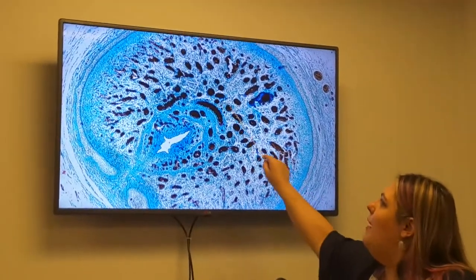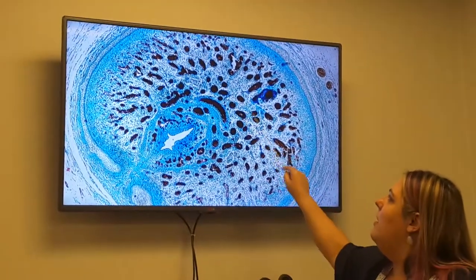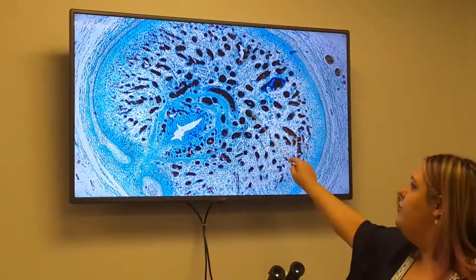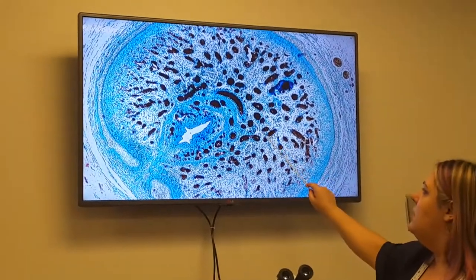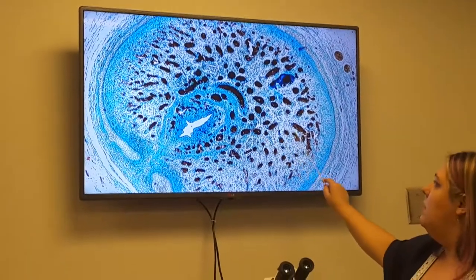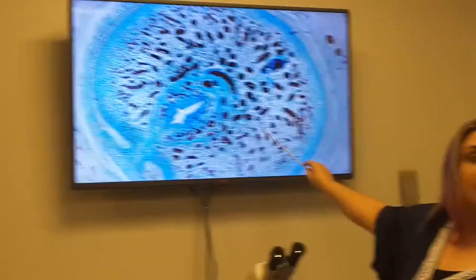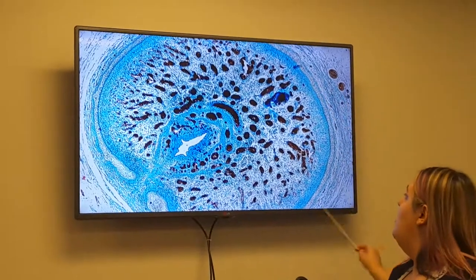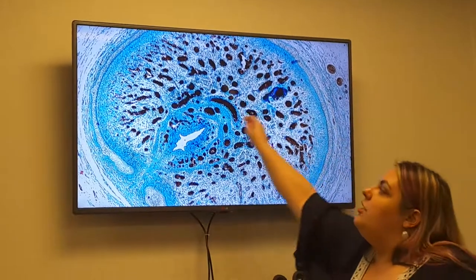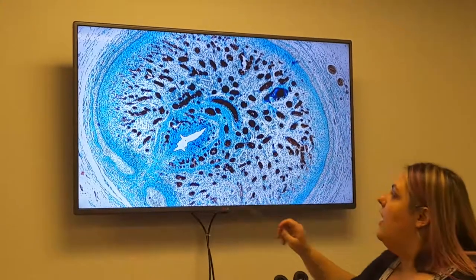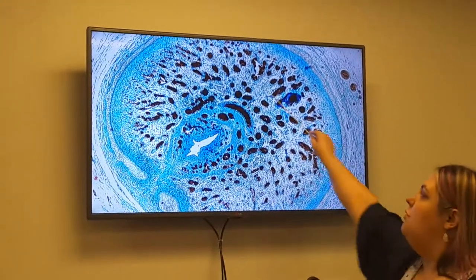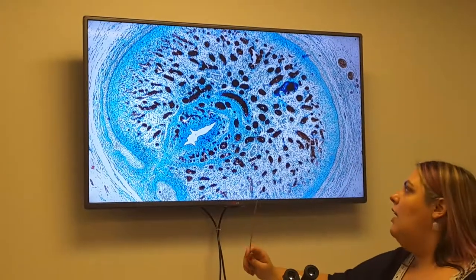What are all these spots inside of there? Blood vessels. Arteries or veins? Arteries in the middle. The veins are out along the edges. And so this is the spongy tissue that will fill up with blood.